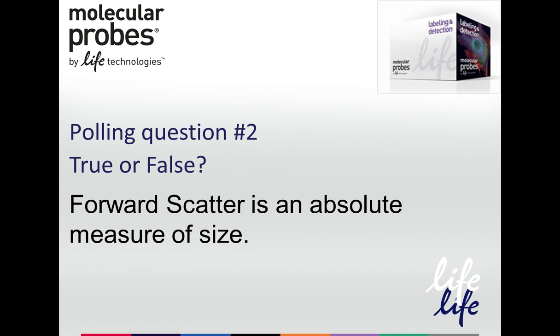So now we're at our second polling question. This is another true or false question. So you can start submitting your response now. Forward scatter is an absolute measure of size. True or false? Forward scatter is an absolute measure of size. And I'll give you about 10 seconds to submit your response.